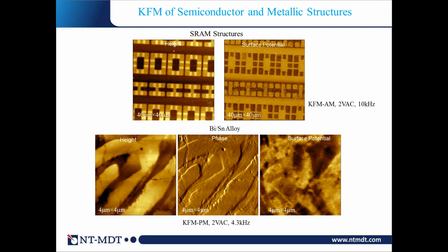For hard materials like metals, there is no way to get compositional maps mechanically, but the electric modes give you broader capabilities in studying the composition of hard materials where the components are not soft and mechanical changes will not be noticeable.